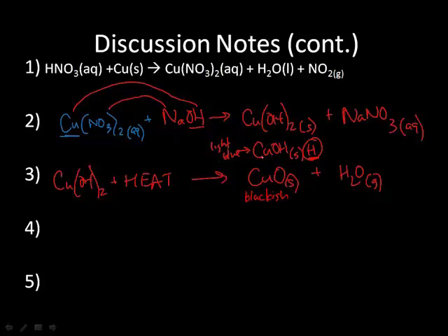However, some of you may have gotten a light blue substance. This is copper hydroxide, and the reason copper hydroxide might form is there were more hydrogens floating around in solution. This could have been because of extra nitric acid, but this sometimes happens upon heating. The product, whether it's copper hydroxide, Cu(OH)2, or copper oxide, CuO, reacts with sulfuric acid.